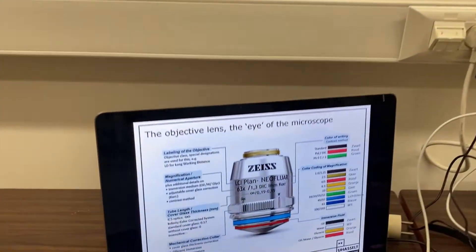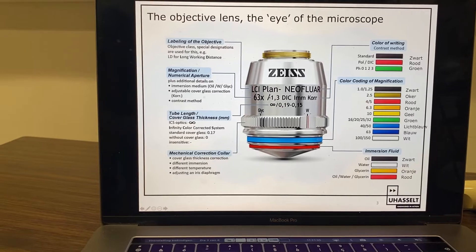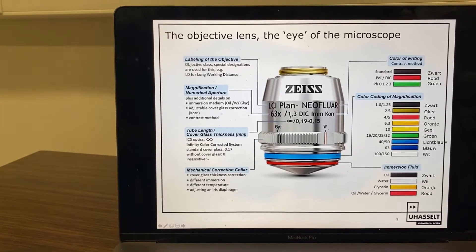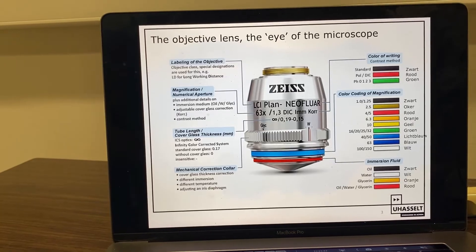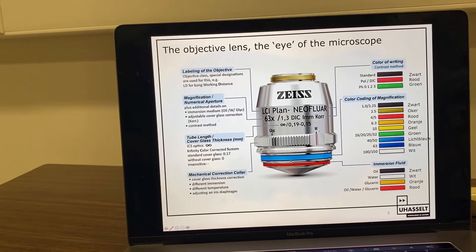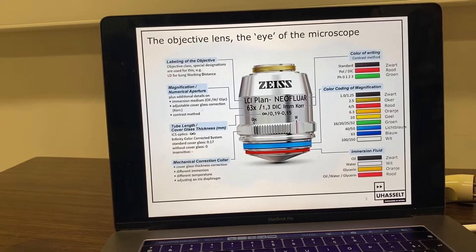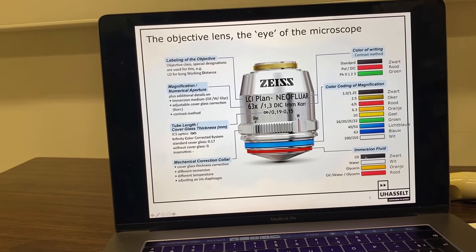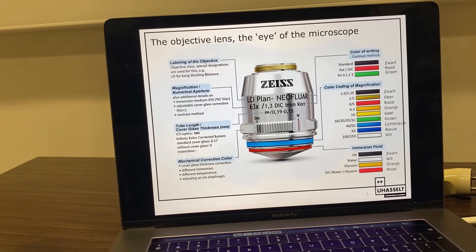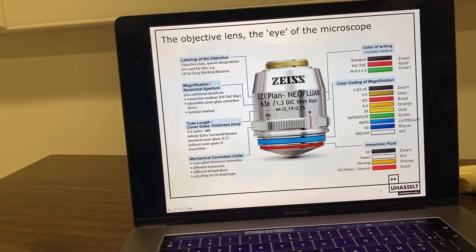On objective lenses there's typically a lot of interesting and useful information written — the magnification, of course, but there's also the numerical aperture. This is a number between roughly 0.1 and 1.5, and the higher this number, the better the resolution of the resulting image. There are also color codings on these objective lenses: one typically indicates the magnification, so it's easy to recognize it just by looking at the color. A second color coding often refers to the immersion fluid used. Many objective lenses can be used in air, but higher magnification, higher resolution images often require immersion in water, oil, or other substances.